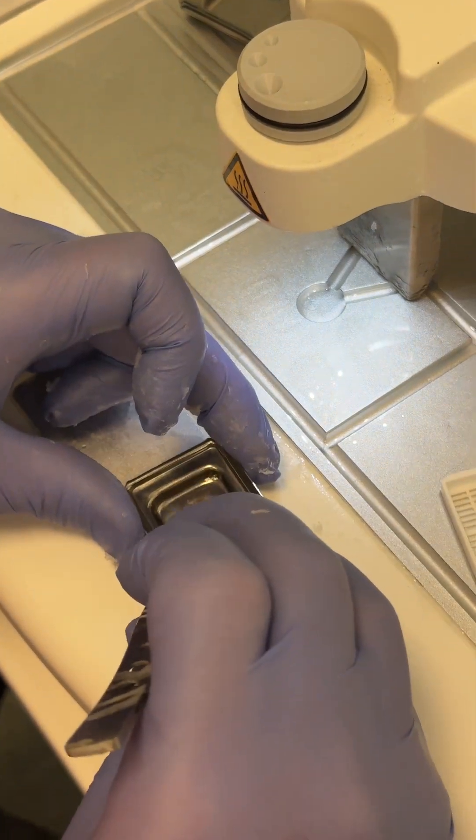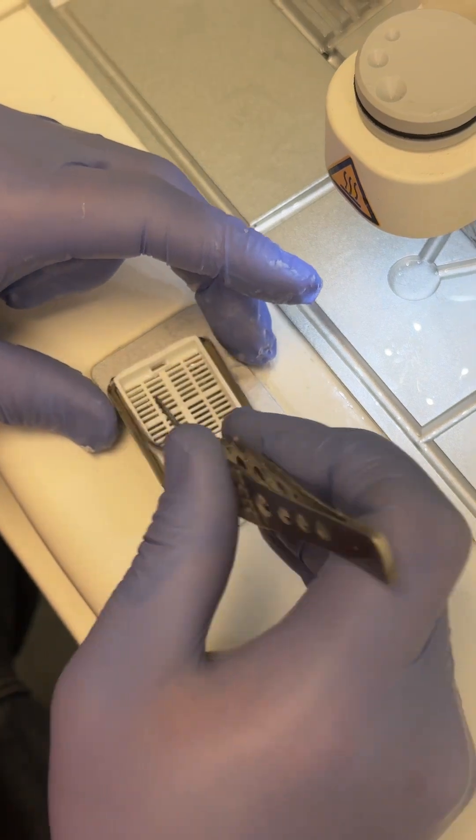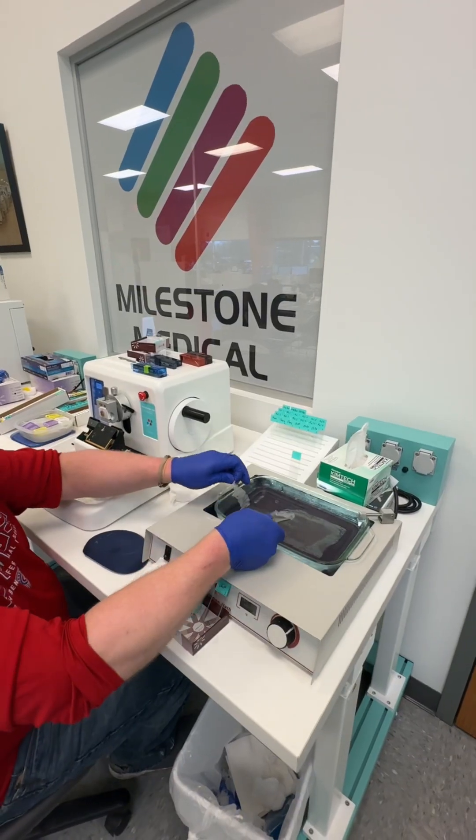Then we head to the embedding station and embed the specimen in a block of paraffin on our embedding center, which keeps the tissue in place for sectioning. Now onto the microtome to slice the specimen into thin sections, place them on a slide, and send to staining.